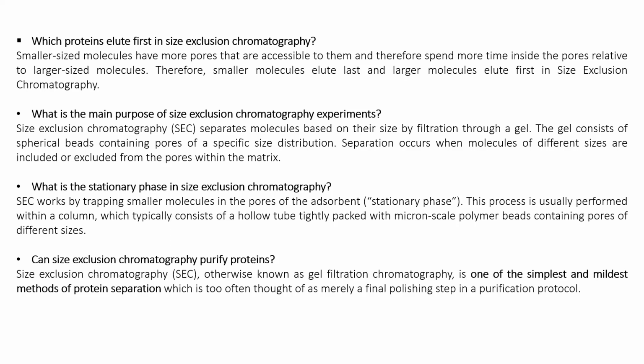What is the main purpose of size exclusion chromatography experiments? Basically, based on the size, this gel filtration method can selectively choose and separate specific sized molecules. So separation occurs here when you have a mix of molecules of different sizes and masses.